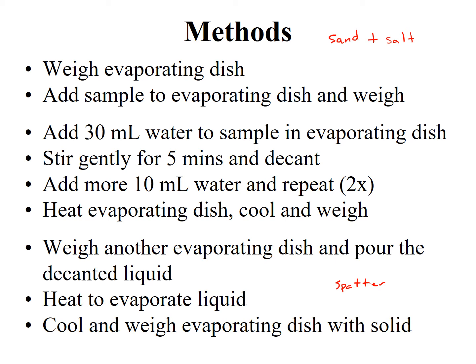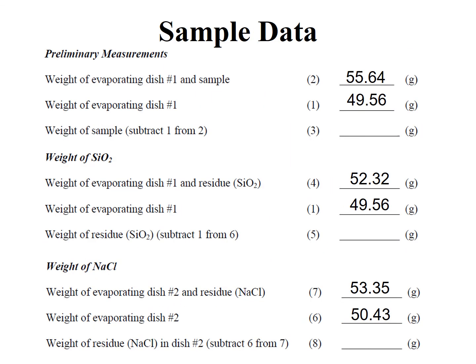So once you have the solids collected, you're going to calculate the data that you have. Now, once you have collected the data, you may have entries like this. This set of data, I will provide to you. In some cases wherein you see some blank in the data, that means you have to fill in that blank. Failure to do so would mean a deduction in your lab report.